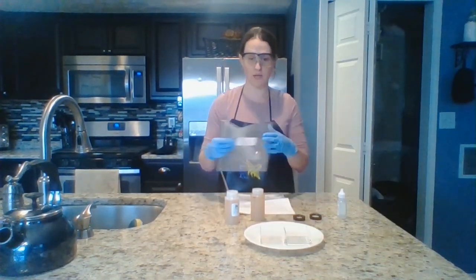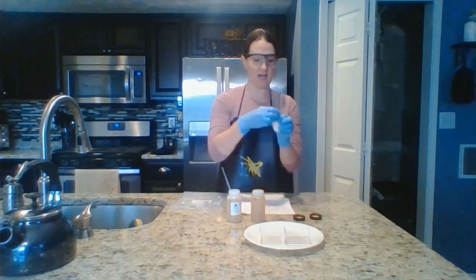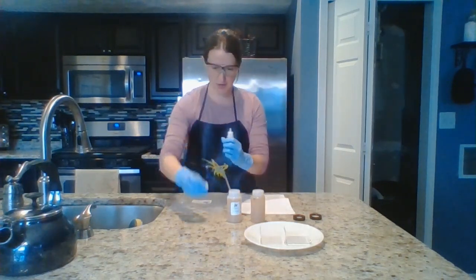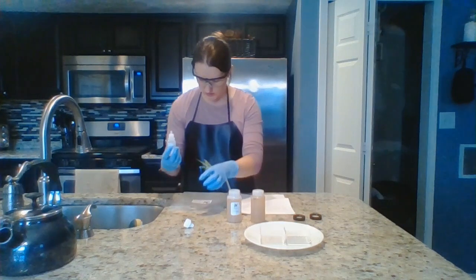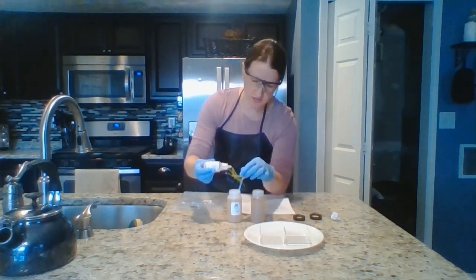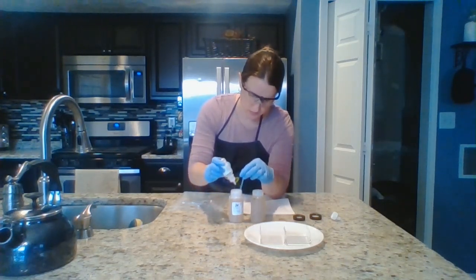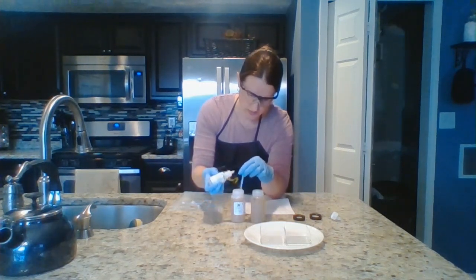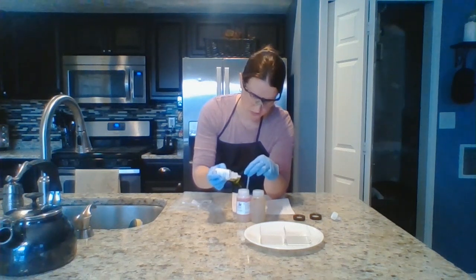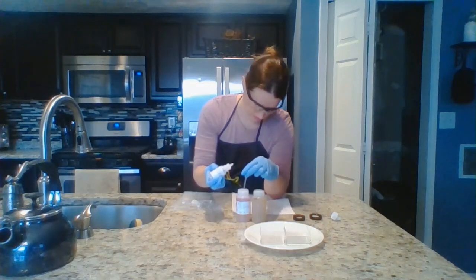Once we finish step 1, carefully filling our bottles and dissolving, next we have to add our 10% sodium hydroxide solution. We're going to add this 1 drop at a time, drop by drop, until the liquid turns a permanent bright pink color. We'll stir as it goes. It's approximately 10 to 30 drops. 6. So that was 7 drops. Not quite pink yet. There's 10 drops.